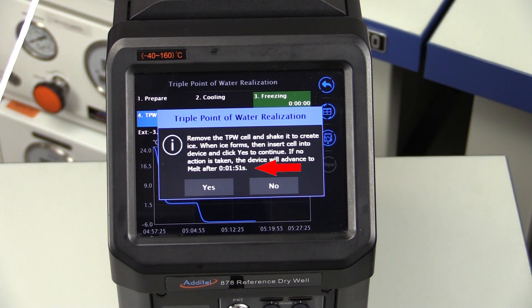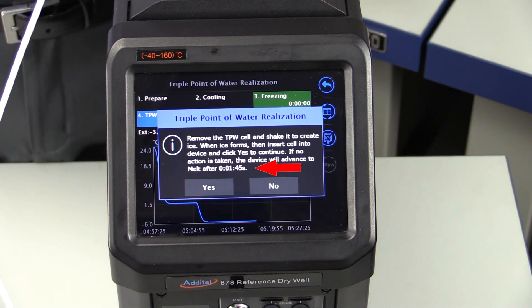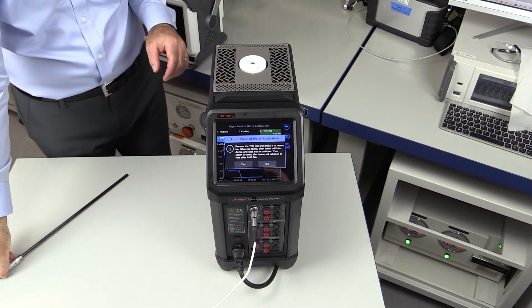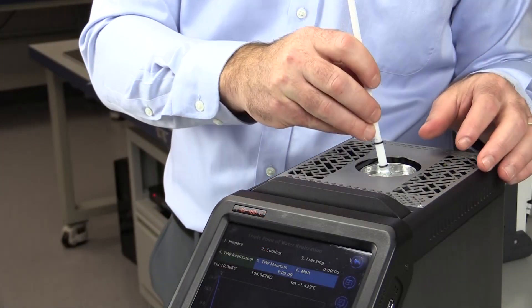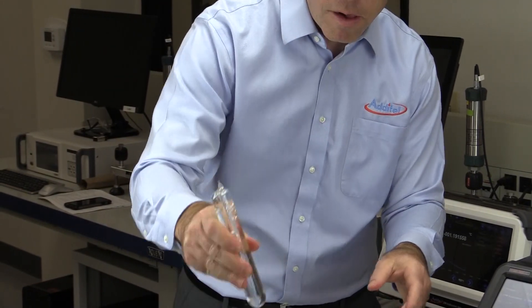If no action is taken at the end of the countdown, the ADT878 will heat the cell back up to protect it from potentially breaking if left at minus 5 degrees C for too long. To realize the triple point of water cell, we carefully remove the reference thermometer and cell basket cover, then use the provided removal tool to carefully lift the cell out of the basket. To achieve the best results, hold the cell in the center and then give it a short, hard shake at an angle.